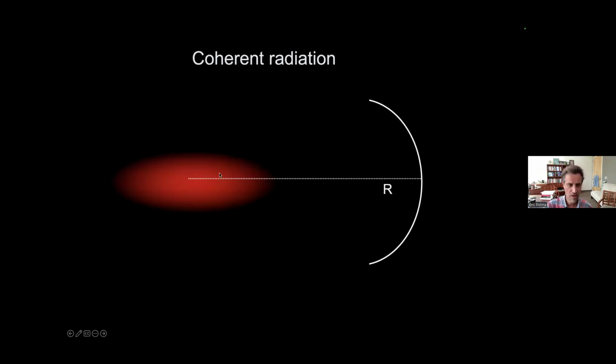So let's say I have now my focus, it's now horizontally oriented, and I have here, over there, this is my detector, okay? So I have just a hemispherical detector in the far field. The distance, of course, is a large distance r away from the focus. So this is not to scale by any means. But let's say I have a point A and a point B. They're both in the focal cigar.